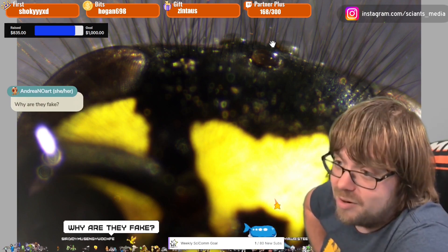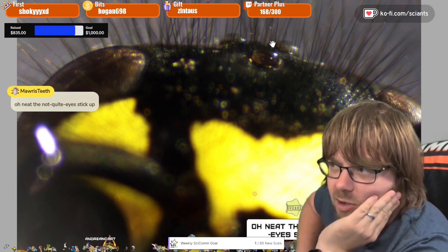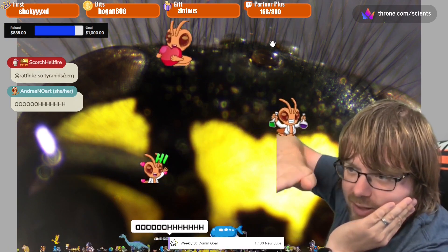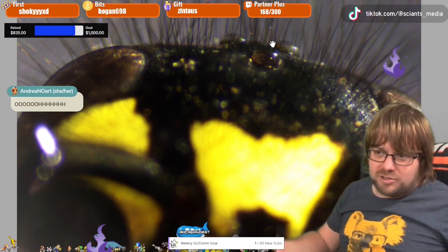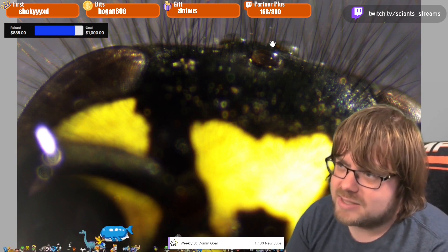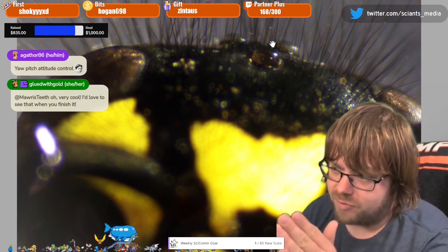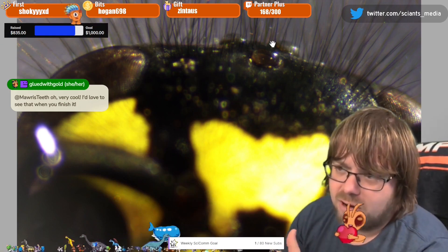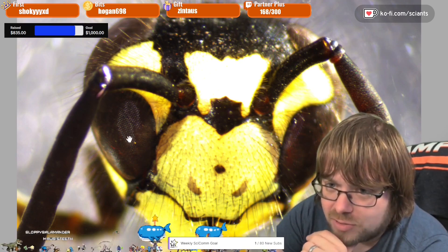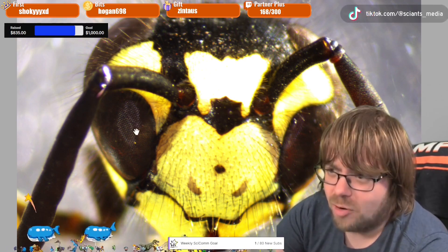They're called fake eyes because they don't see images - they detect UV, so they're more used for orientation when you're flying, using the sun to give you a sense of direction, like where you're flying towards the horizon and steadying yourself. You're not getting an image, but you're still receiving information. It's something much more on the flying side of things. Terrestrial insects won't really have it. Even in ants, the queen will have the triple set, but the workers might have just one, and the size correlates with how long they're outside the nest.